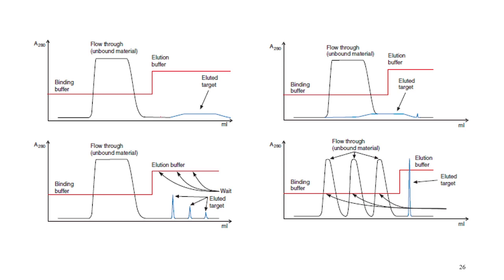And these are the other graphs as well, you can look into this. Sometimes what happens, so these four graphs are: the first one is that when you have started an elution but your protein is not showing a particular peak. It might happen if your protein is not stable enough or is an unfolded protein, then you might not be getting a peak.